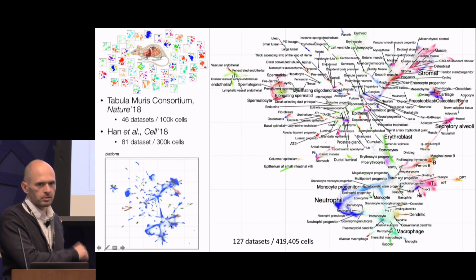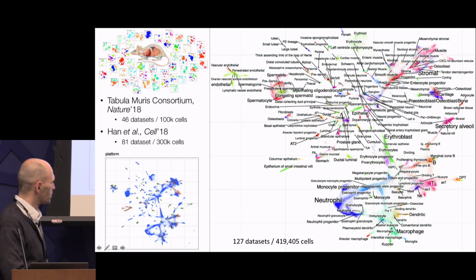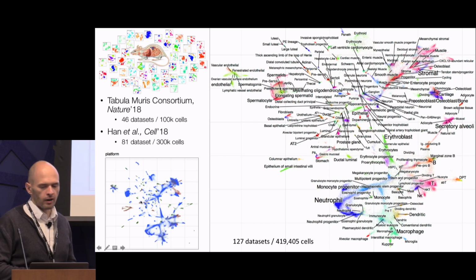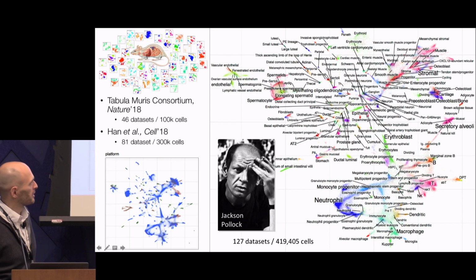So even though these two teams did an amazing, pioneering job doing these types of whole organism atlases and spent a lot of effort, from the lack of overlap in a lot of these tissues you see that we're pretty far from having a comprehensive, well-covered mouse atlas anyway. So this is again the view of Tabula Muris annotations. Now it's pretty messy, and this is just for Bogdan.